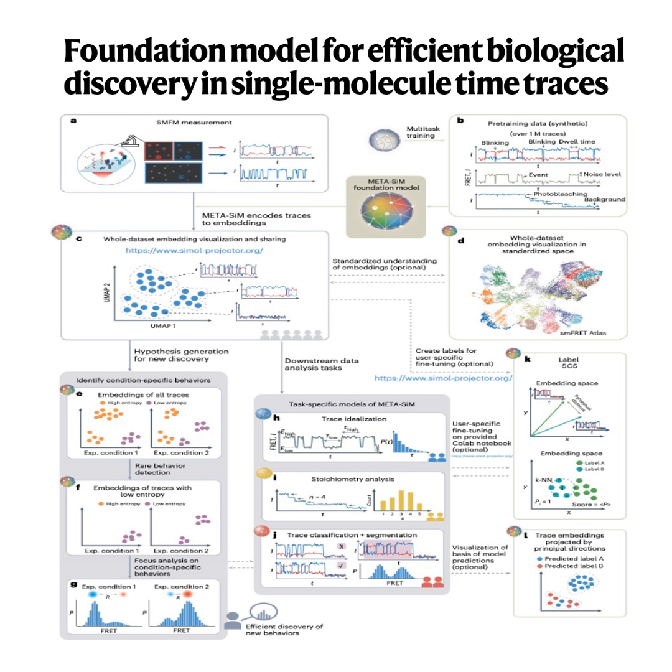All right, so the model itself is powerful. It can process traces accurately and efficiently, but the ultimate goal is biological discovery, right? Finding something new. How does META-SiM help a researcher see that needle in the haystack, that rare event? That brings us to the visualization side of things, the META-SiM Projector. Okay, a projector. What does it project? It projects those high-dimensional embedding vectors, the digital fingerprints we talked about, into a space we can actually see. It's a web-based tool, so you can access it in your browser.